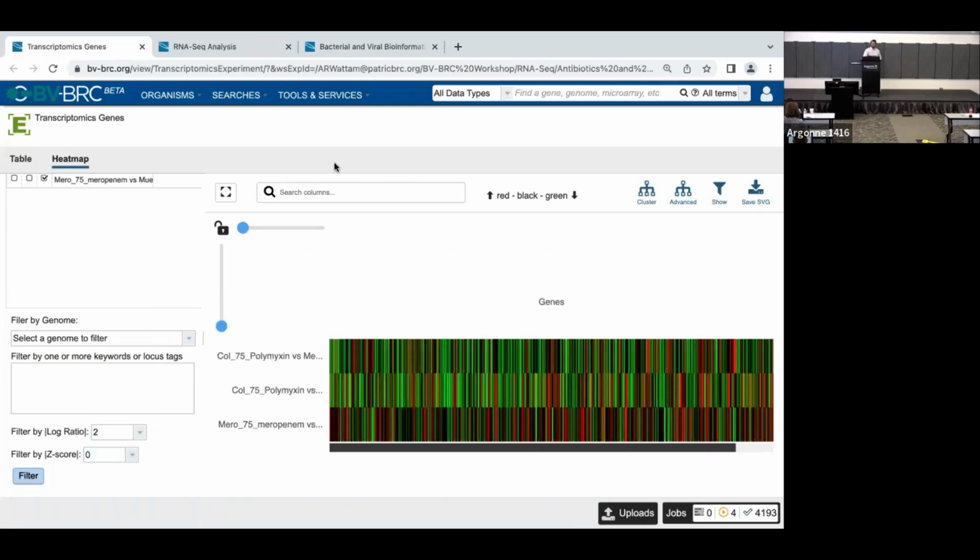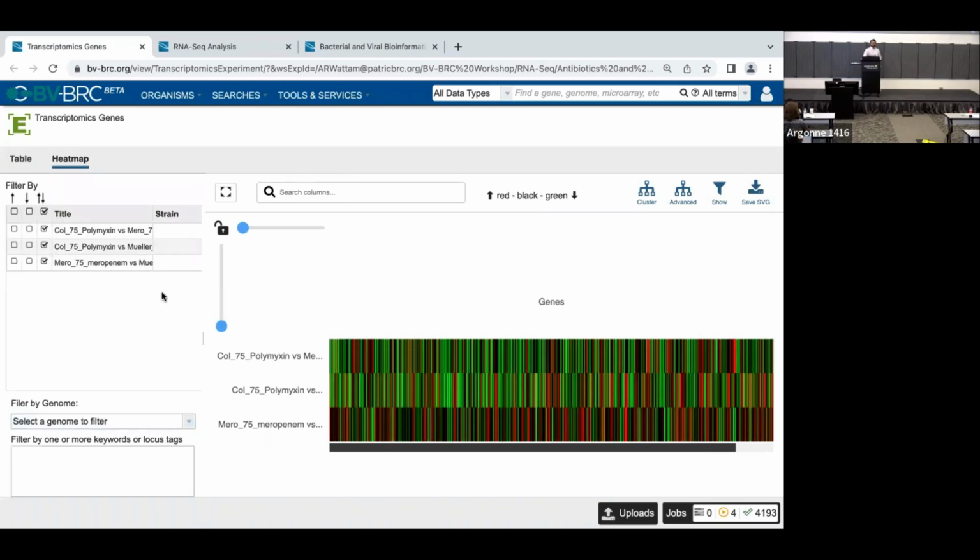So I think there was one question over here which asked, can we see only statistically significant differentially expressed genes in the heat map? One of the files that we have in the output from the DE-seq also gives you the p-value, and it will be useful when you have multiple replicates, because if it's just one sample, then it's not that interesting or powerful. You can use that file and filter out the genes if you want, and then cut and paste it here and see only the expression of those genes.